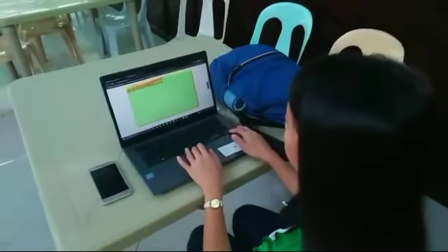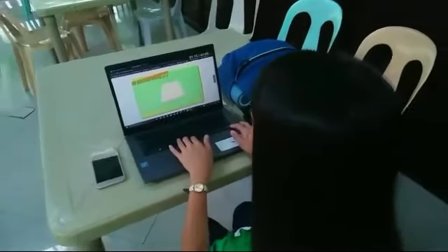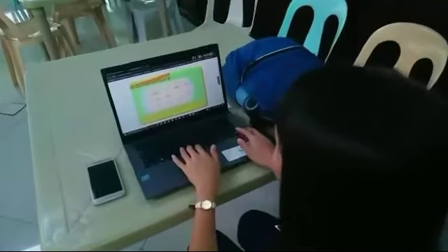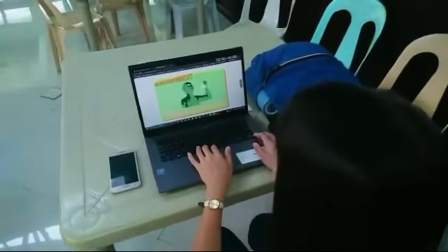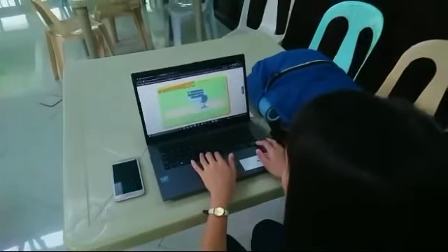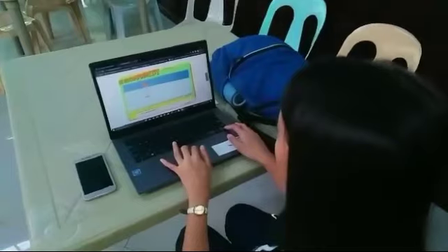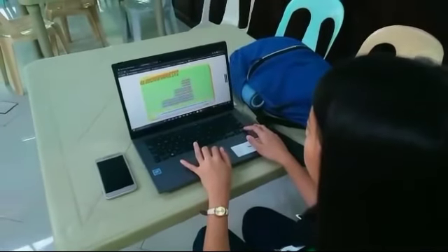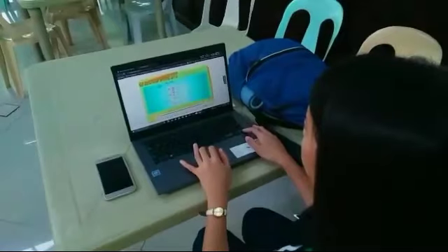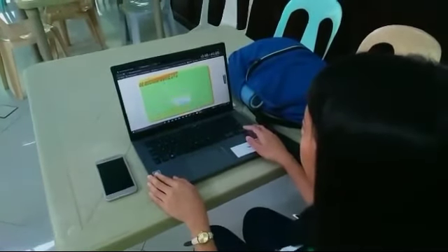Maybe you are wondering what kind of virtual laboratory I'm doing. This is gel electrophoresis, the way to sort and measure DNA strands in a tube even though you can't see or touch them. Scientists use gel electrophoresis whenever they need to sort DNA strands according to length. This technique is also useful for separating other types of molecules, like proteins.